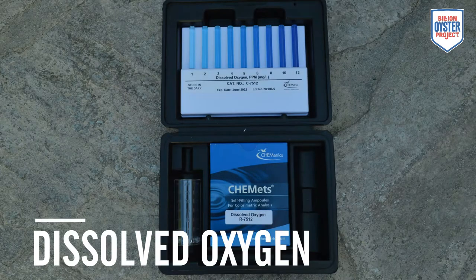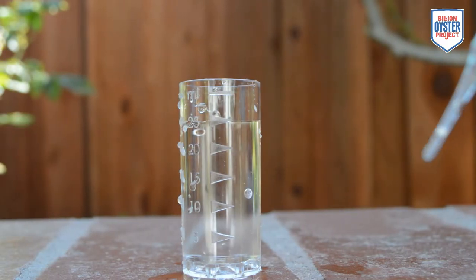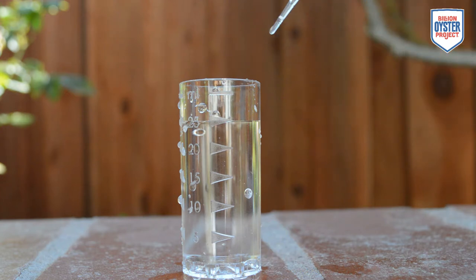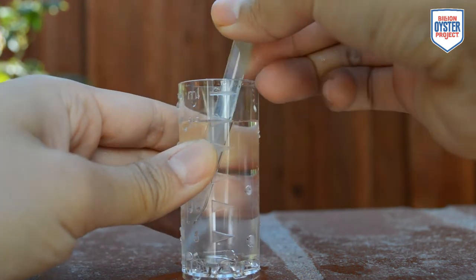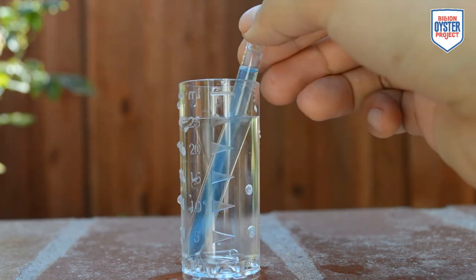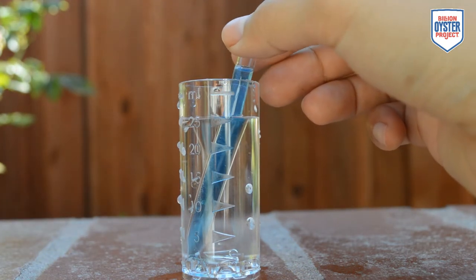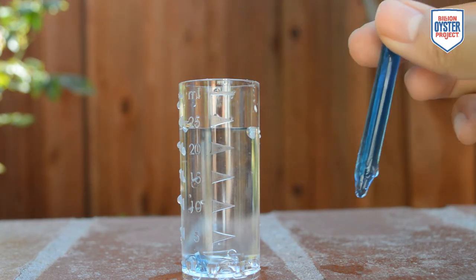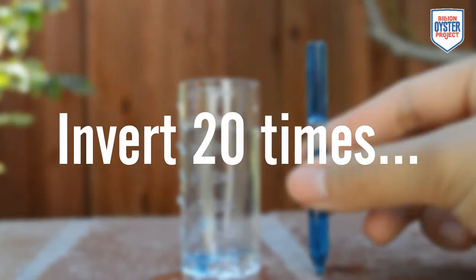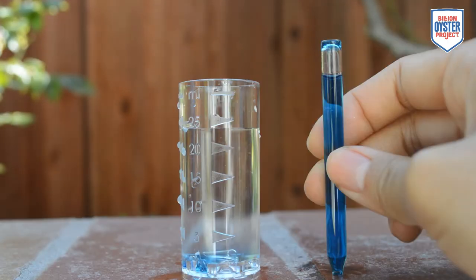To measure dissolved oxygen, we will be using the CHEMetrics Colorimetric Test Kit. Fill the provided sample cup with 25 milliliters of water and place one ampoule tip-side down into the water. Break the tip of the ampoule in the water by pressing it against the side of the cup. Allow the ampoule to fill with water from your sample. Next, take your ampoule out of the cup and invert it 20 times, allowing the bubble to reach the top of the ampoule each time you invert.